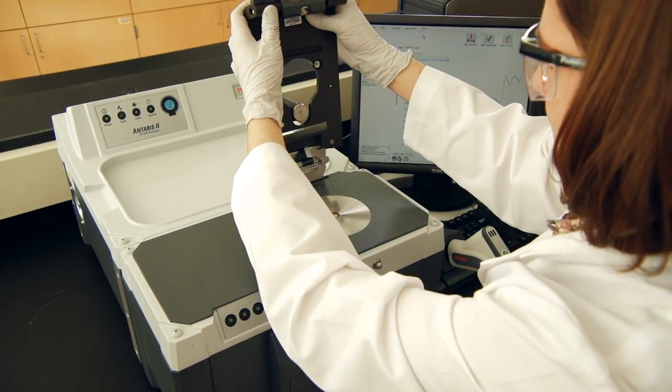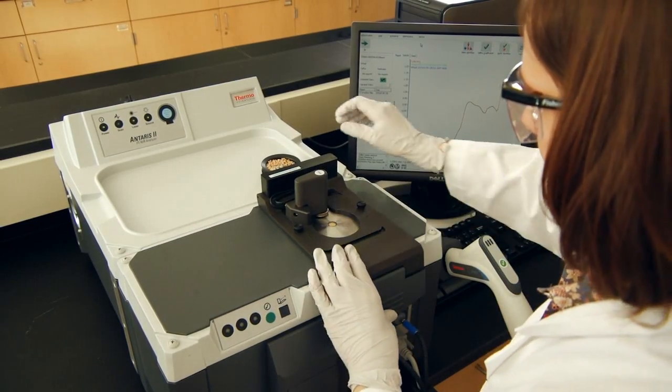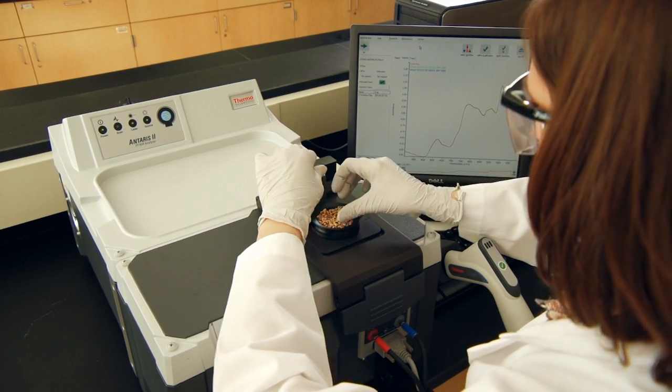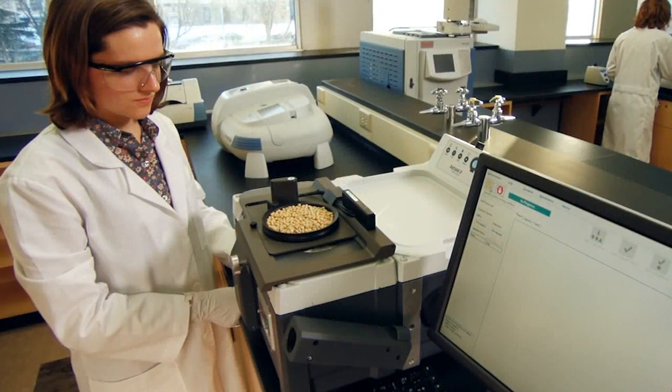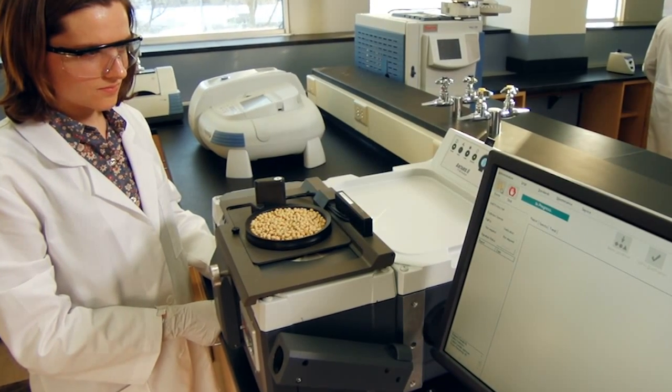With a wide range of easily swapped integrating sphere accessories, the Antares II can address all of your food and feed analysis needs, from raw materials to final products, including a sample cup spinner to accurately analyze heterogeneous samples.